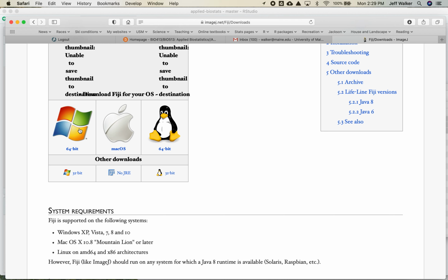If you're using Windows, you need to learn about your machine, to know whether you should download the 64-bit version or the 32-bit version. If you have a 32-bit machine, it won't run this 64-bit version. If you have a 64-bit machine, there may not be backwards compatibility with the 32-bit version. So we're doing this on a Mac OS, so I'm going to install the Mac OS. And there it goes. So I've just downloaded that.